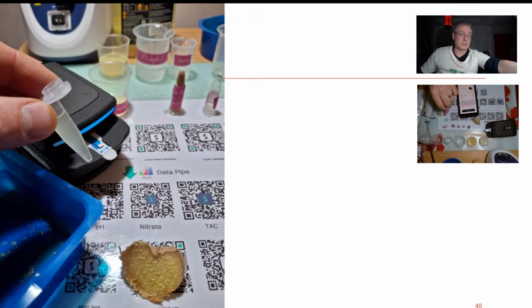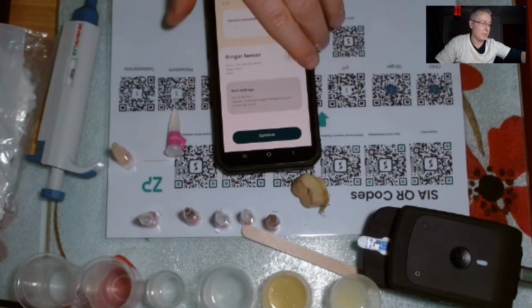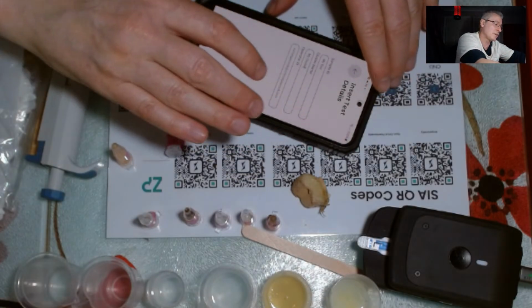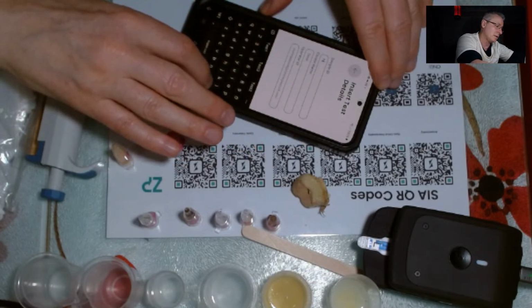So what I want to do is a quick demonstration or test on this. The Sensi-All potentiostat is a really unusual potentiostat. I just want to check something here. I'm just going to put some names in so I can find this data in a bit. Demo Strath, I'll put in.